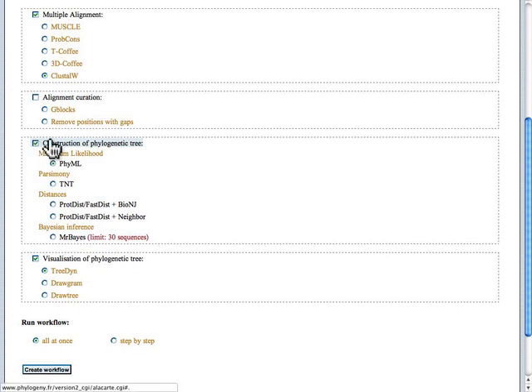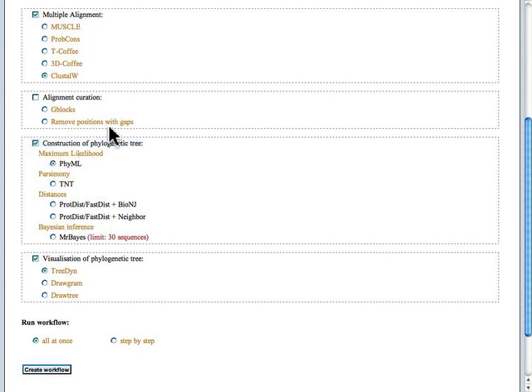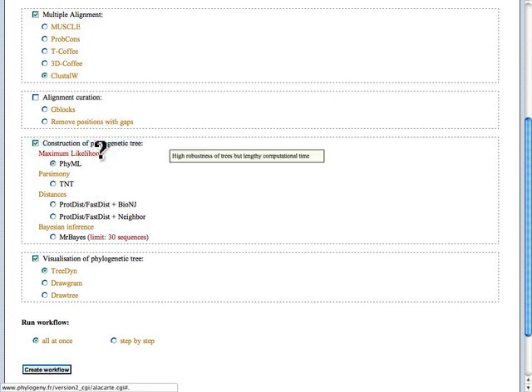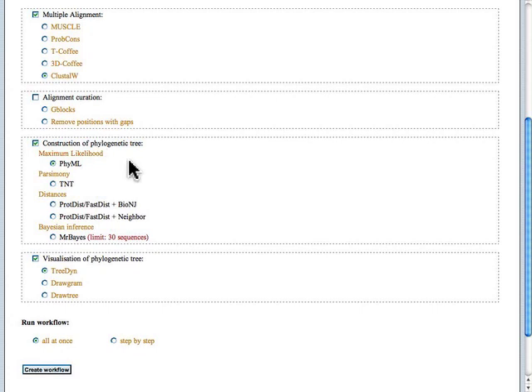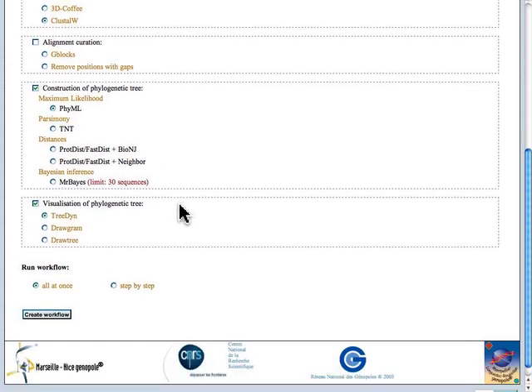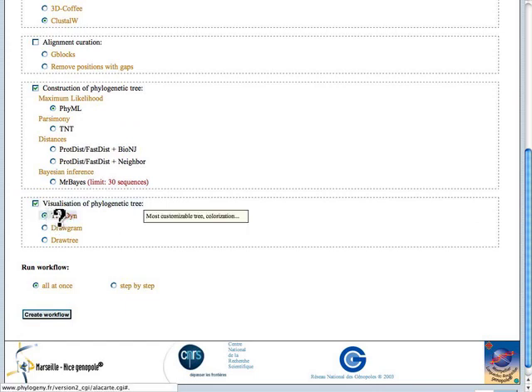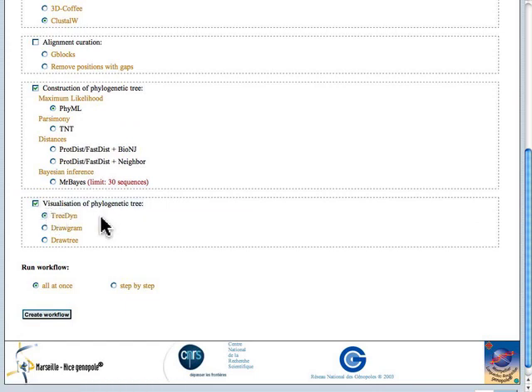When we build the phylogenetic tree from the multiple sequence alignment, we can use the maximum likelihood tool there, PhyML. And then, for visualization, we will choose the TreeDyn.